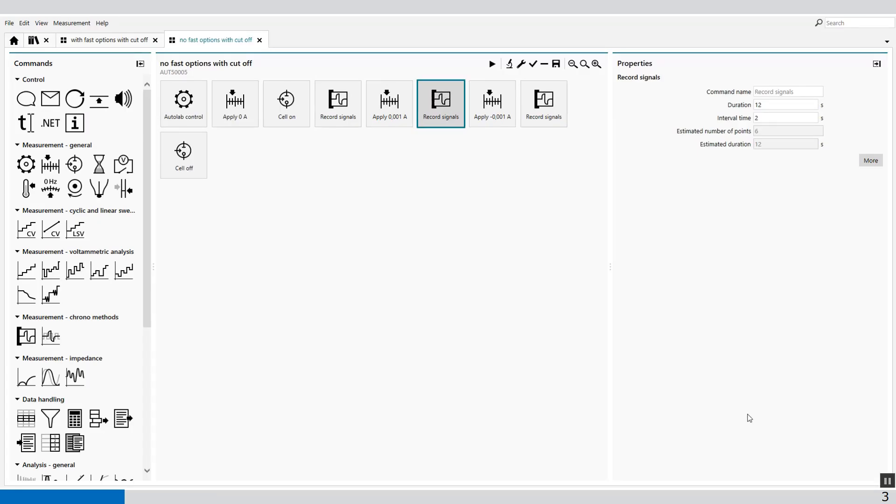Welcome to the NOVA software. When the fast options are used, the options are now verified after each user-defined fast interval time. This means that the options can be verified at a faster rate than the sampling rate. The measurement options are decoupled from the sampling of the data.